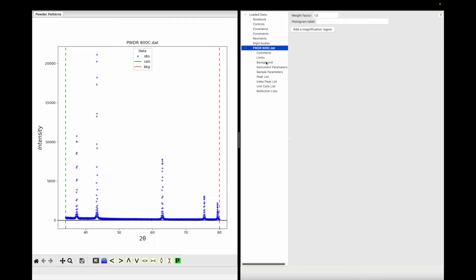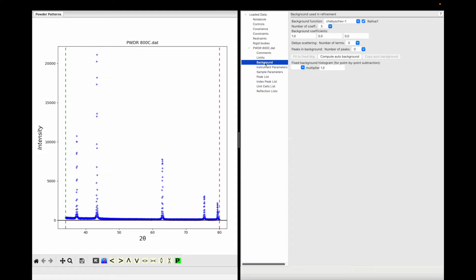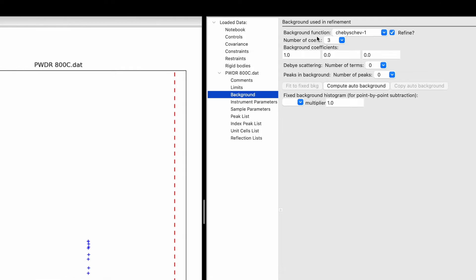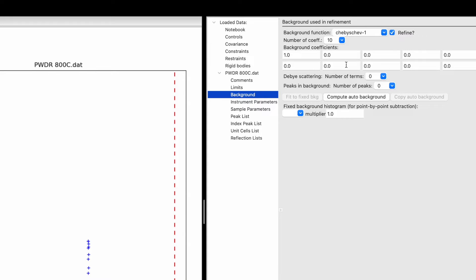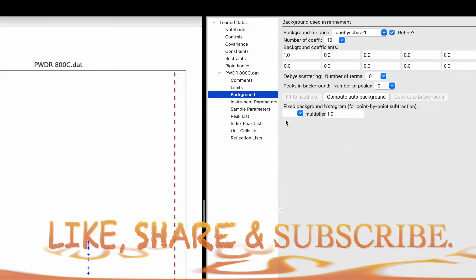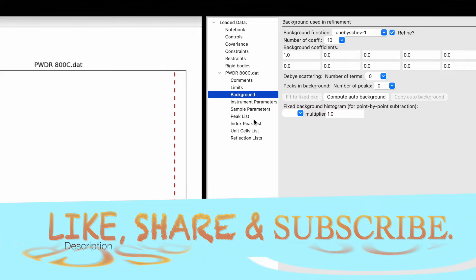Now you can go to the Background tab. Here you can see the XRD data, where the background looks pretty flat. So in this case I will keep the background function as default and I will choose the number of coefficients to be 10. This number varies depending on how your background looks.